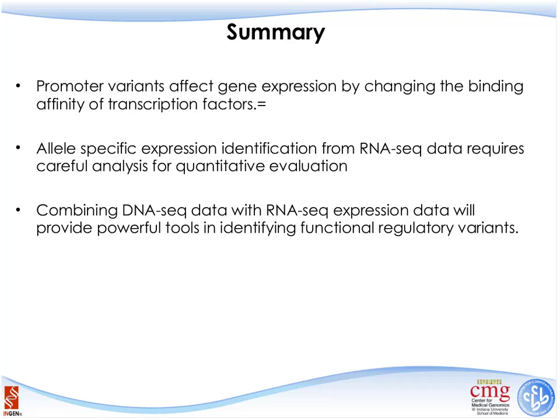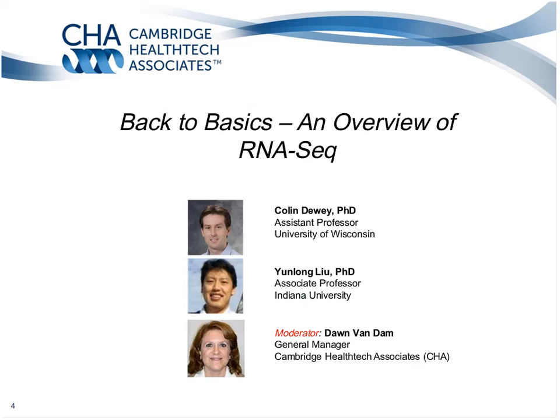So maybe the first question I will refer to Colin. Colin, what is the current state of de novo transcriptome assembly methods, and how should one choose between them? Great, thanks for that question. Yeah, currently there are a number of de novo transcriptome assembly methods out there, although I would say that's still the early stages, and there are new advances coming out every day. Some popular ones are Trinity, Oases, Trans-ABySS, SOAPdenovo-Trans. These are some of the ones that we've looked at.